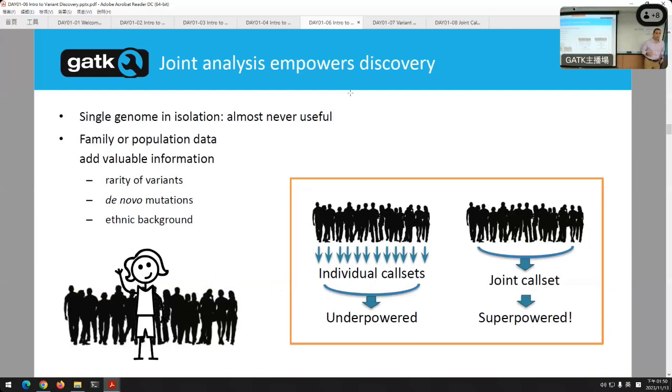Right, which one is the one that's causing the disease? Which one tells you what's affecting the baby? You have no idea. So the only way to do that is to take all 3 million mutations and study them against what the rest of the world has. If you find a mutation in that baby that no one else has, and it's one of the genes, there's a good chance that's the one.